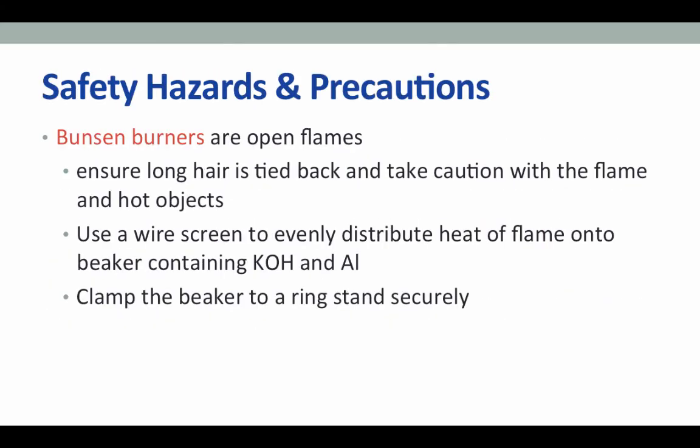There are some significant dangers in today's experiment. You are going to be working with Bunsen burners and also with strong acids and bases. So let's review some safety hazards and precautions. Remember that a Bunsen burner is an open flame. So it's very important to make sure that all long hair is tied back away from your face and to take caution with the flame and hot objects. Be aware of what you are doing. Remember that just because you've removed a beaker from a flame doesn't mean it's instantly cool. Allow it to cool before touching.